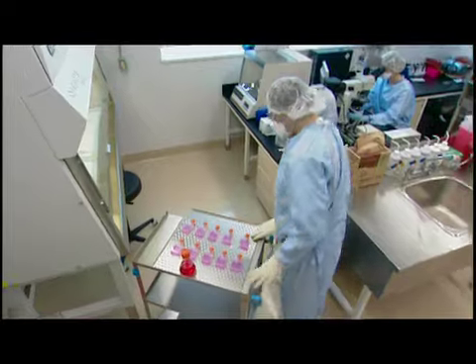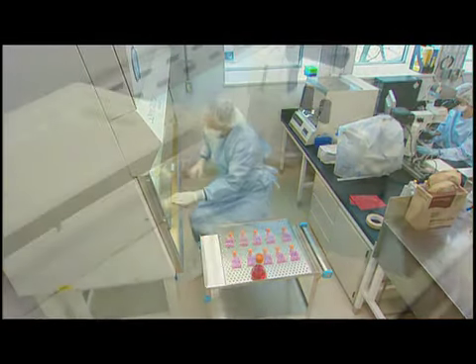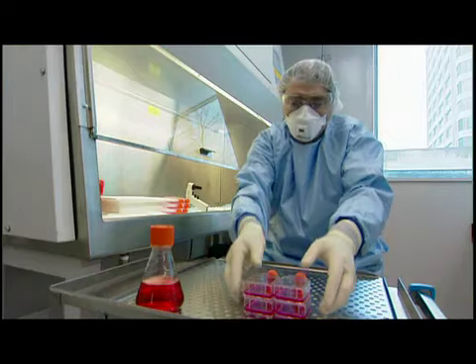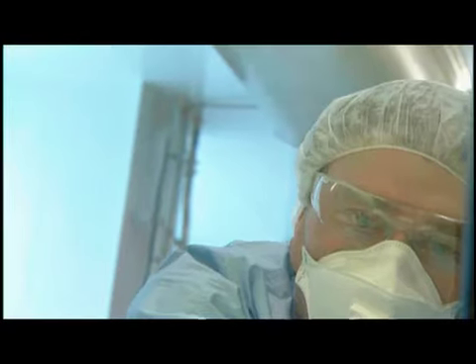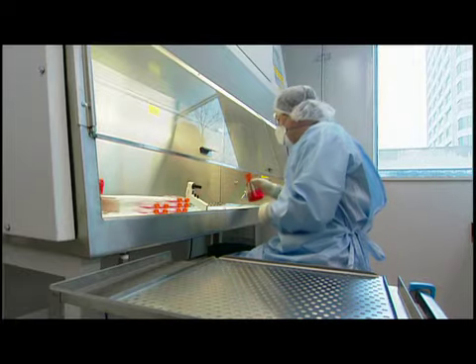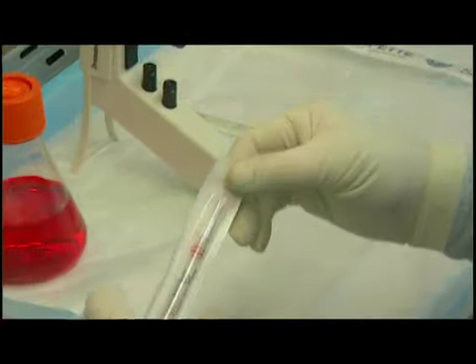Always using a trolley, bring your assembled material to the BSC. Load the articles into the cabinet. You should separate them into clean and dirty. Wait 5 minutes prior to starting your work. The second step is actually working in the BSC.